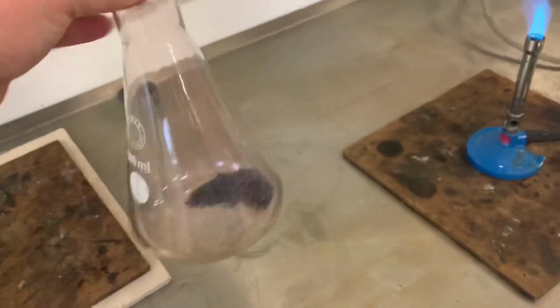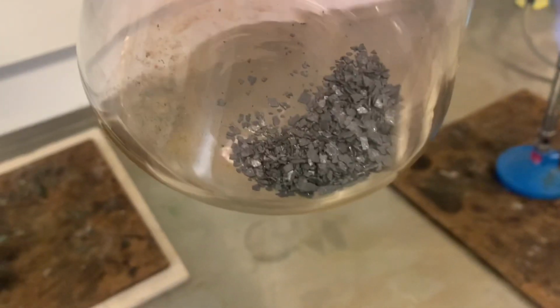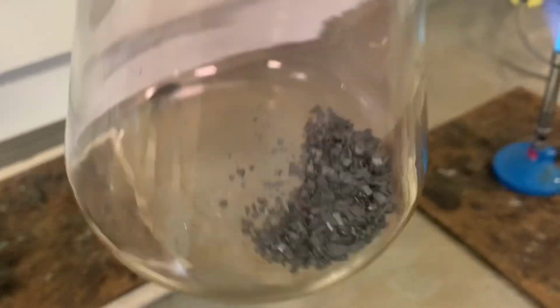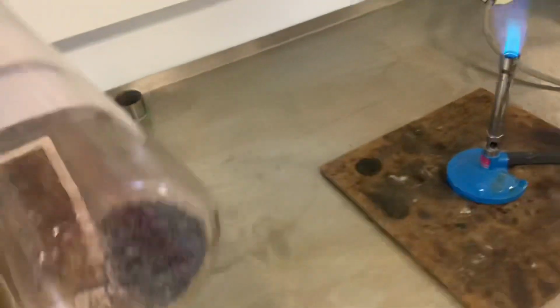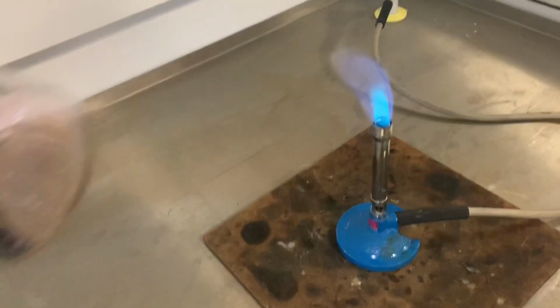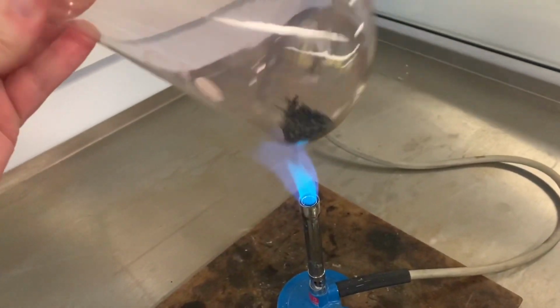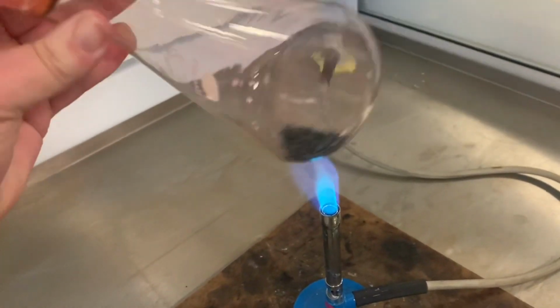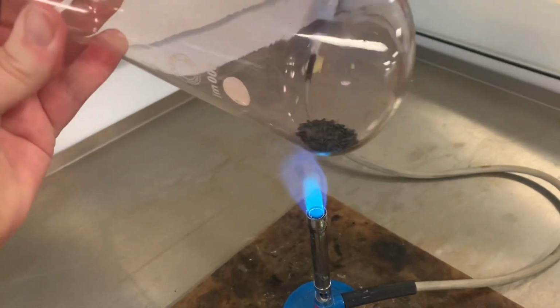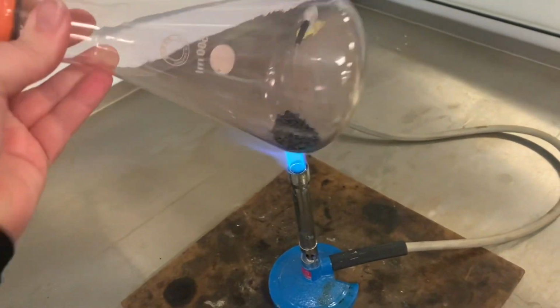Okay, it might be hard to hear me because the fume cupboard's on, but in the bottom of the conical glass we've got some grey flakes of iodine crystals. They're solid iodine. We have to do it in the fume cupboard because we don't want to breathe in iodine vapour. So when we heat this very gently, you will see that the grey flakes will turn into purple vapour, or dark violet vapour.